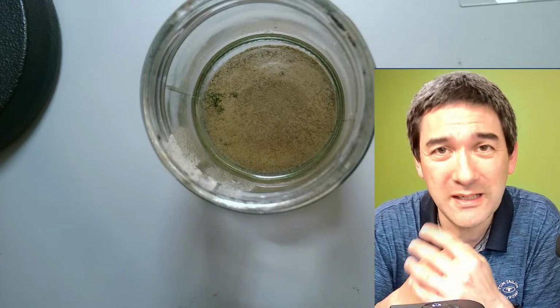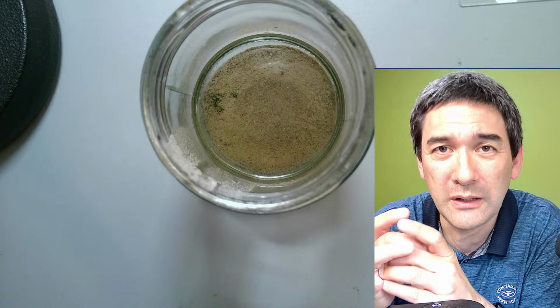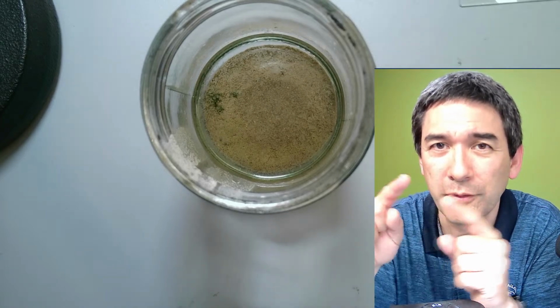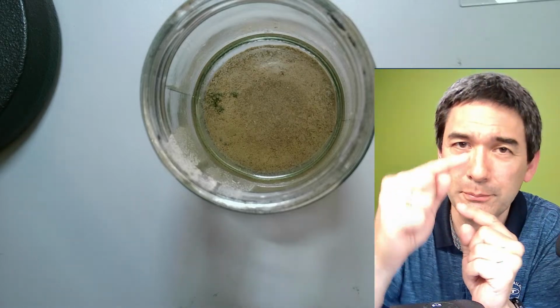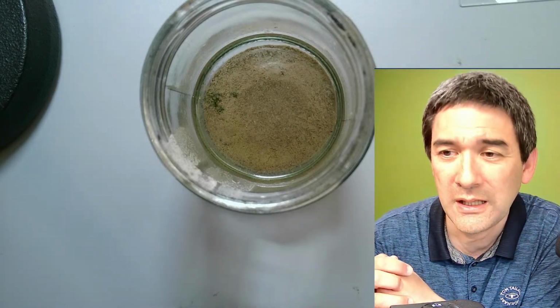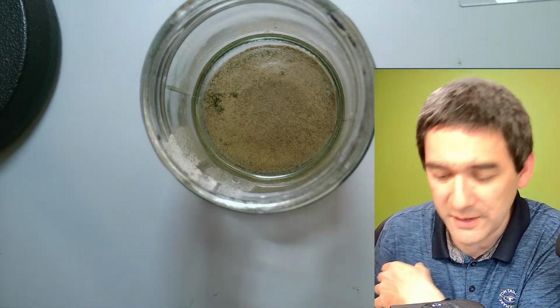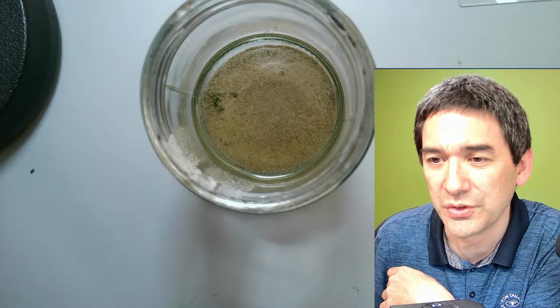So this basically means that you have to really try to limit the light only to the place where you're looking. If there's too much reflection on the side of the tube, then this can cause a bright spot in the center, right? I don't know if there's an easy way to solve this. But that's the reason in most cases.